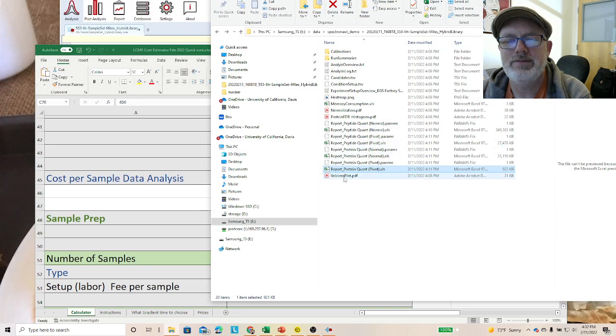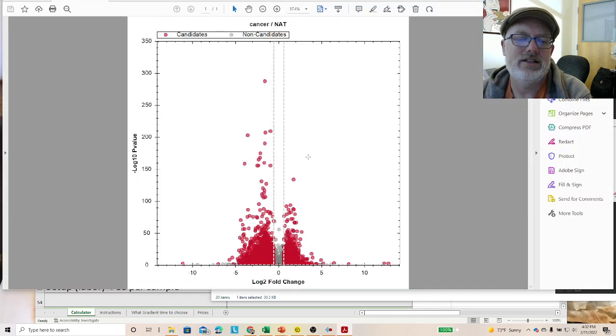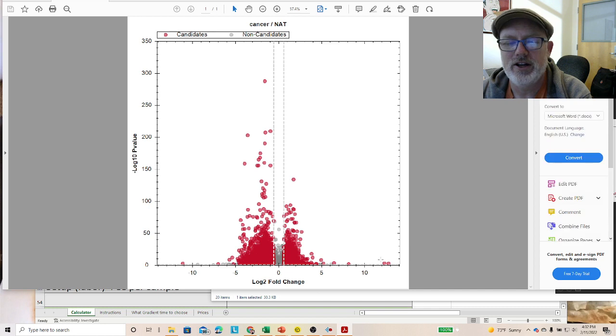All right, and last but not least, the Volcano plot. It's not really interactive, so it's not really useful, but it's nice to view. Usually Volcano plots are log 2 fold change on the x-axis, log 10 p-value on the y-axis. So you can see which ones have a large fold change with a low p-value, for example.